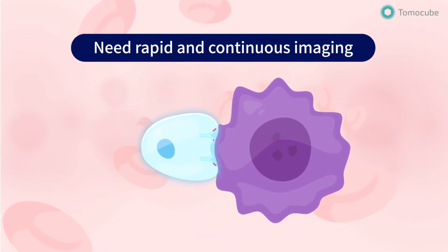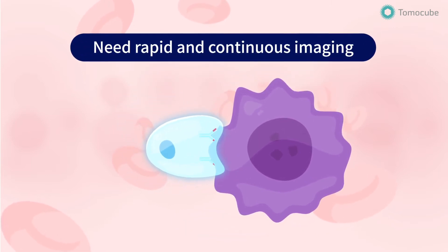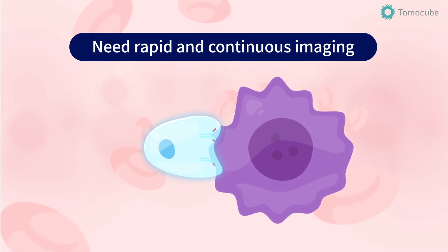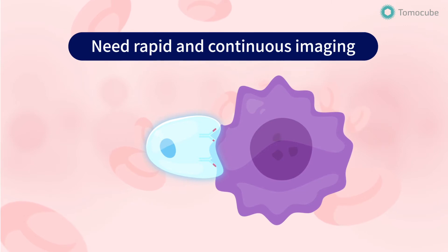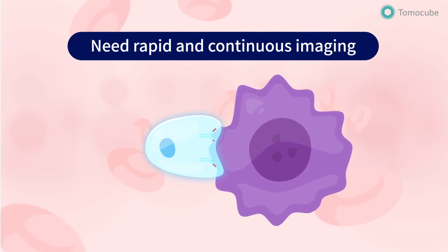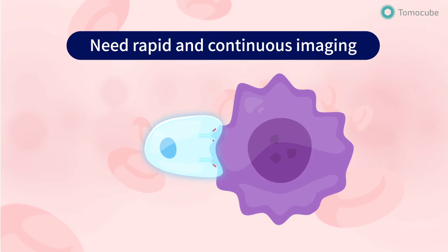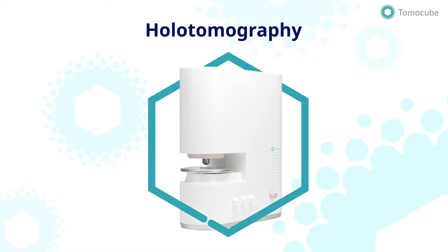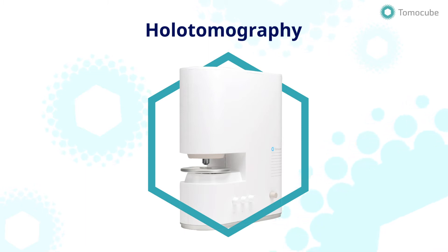The cell-to-cell interaction is a dynamic process, which involves active changes in morphological and biochemical properties of the immune cells. Thus, visualizing this process requires rapid and continuous imaging of live cells. Here, we use the new holotomographic microscopy to image and quantify cell-to-cell interaction in the immune response.